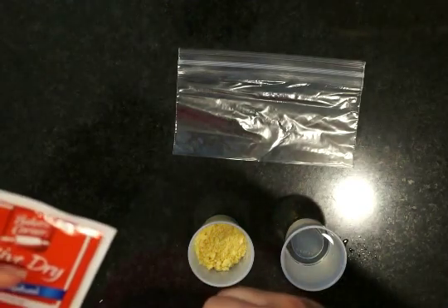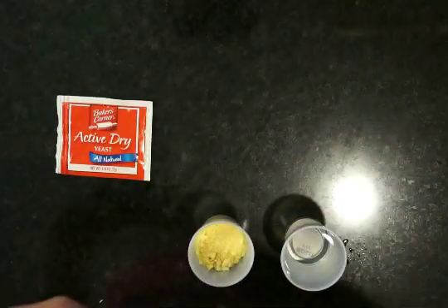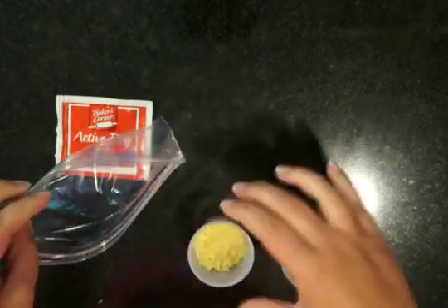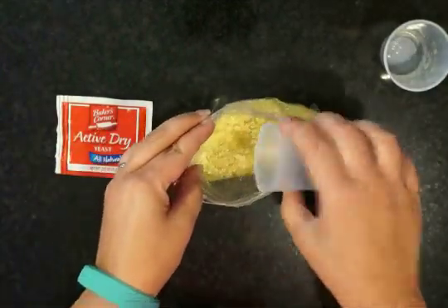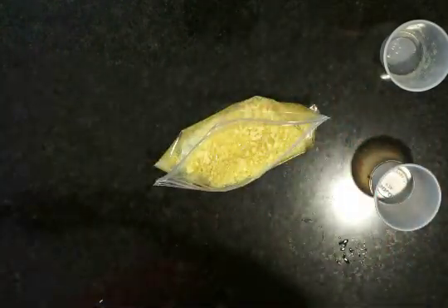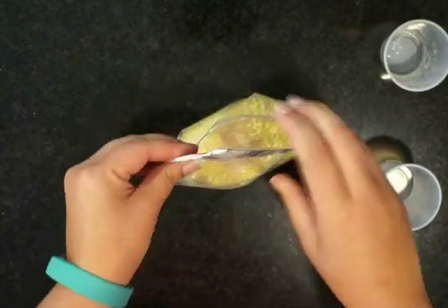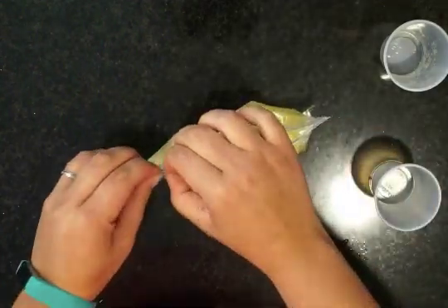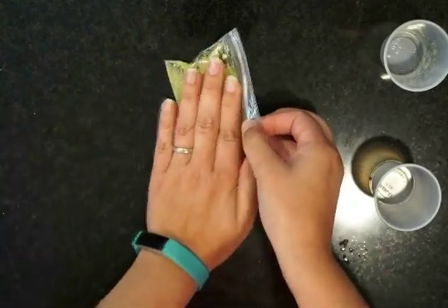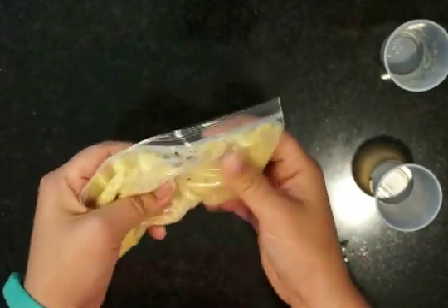I'm going to cut open my active dry yeast — I only need one packet, but since it comes in a set of three, I thought I'd show you that. Then we're going to open up the zipper bag and pour in the cereal and the warm water. It should be warm, not hot, and definitely not room temperature. Then I'm going to open up my yeast and pour that in too. We're going to close it up and get rid of as much air as possible, then squish it around and mix it all up so that it's really well combined.